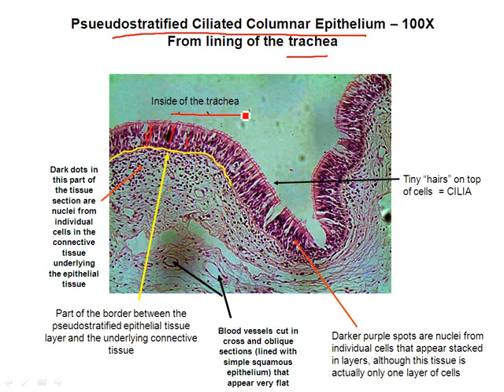So the dust gets caught in the mucus, and then the cilia start to sweep that stuff back up the trachea. So when you clear your throat or cough, you're actually coughing up that mucus that has all the dust that you've been breathing in all day. So it keeps your lungs, again, from filling up with dust and not being very functional. So that is why we like to make sure that you see these ciliated cells inside the trachea.